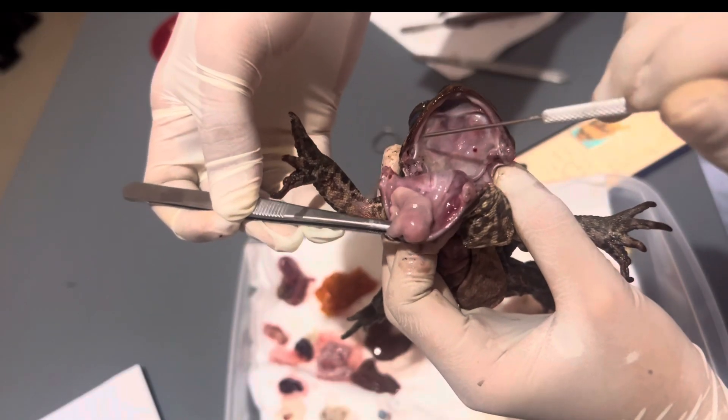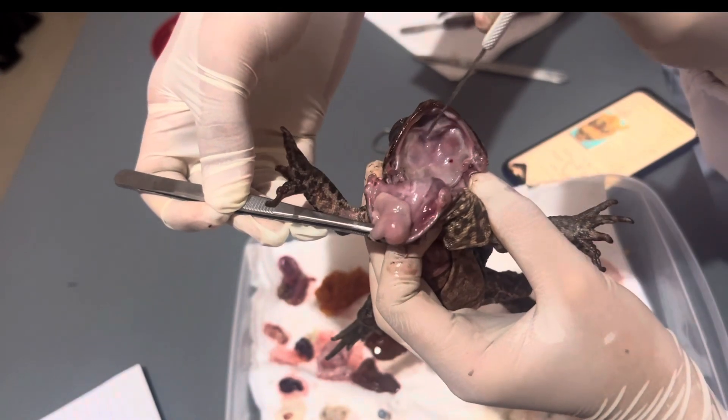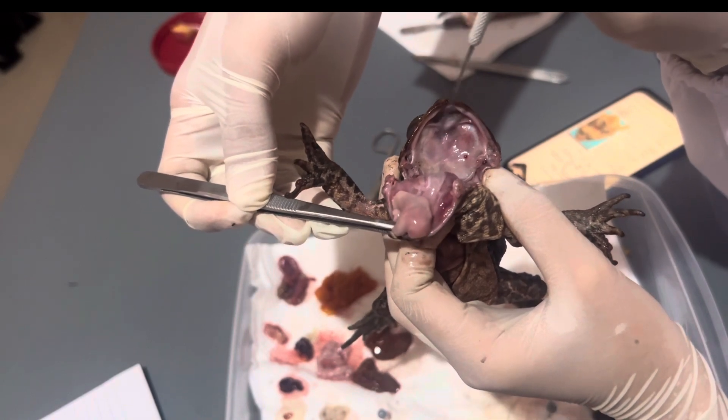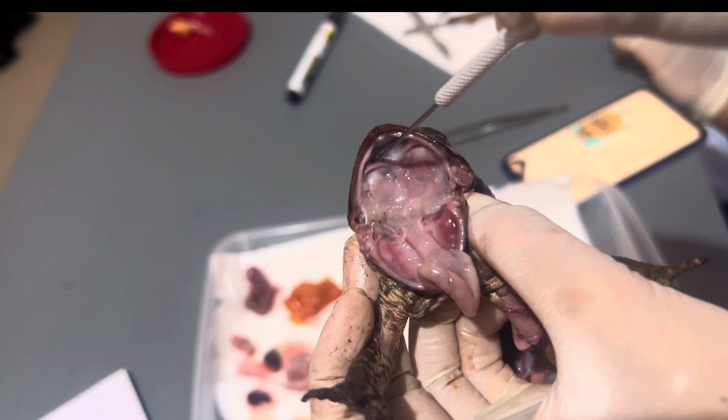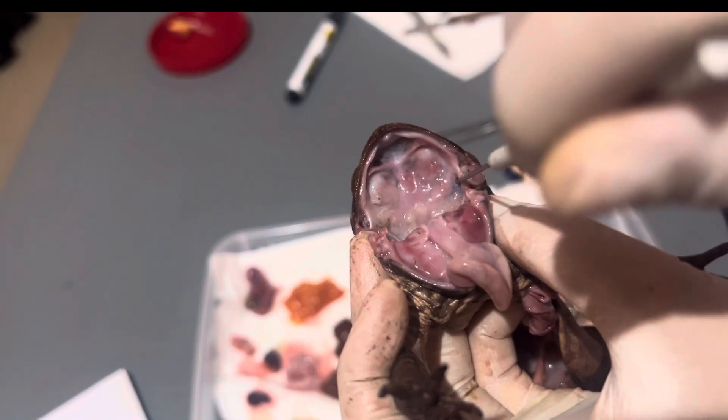The maxillary teeth — this is used for holding prey and it is located around the edge of the mouth. Here are its vomerine teeth — this is also used for holding prey and it is located at the roof of the mouth. Internal nares — these are connected to the lungs and they are the main breathing pathway of toads.